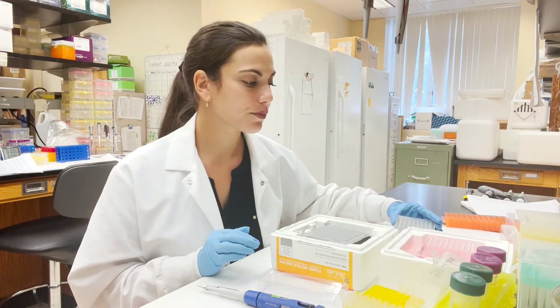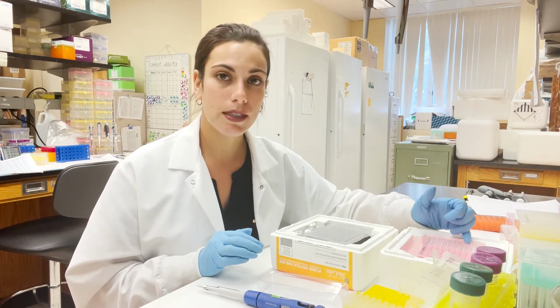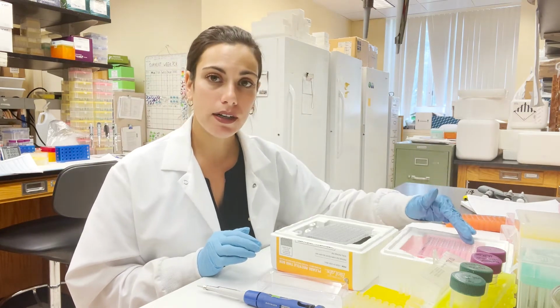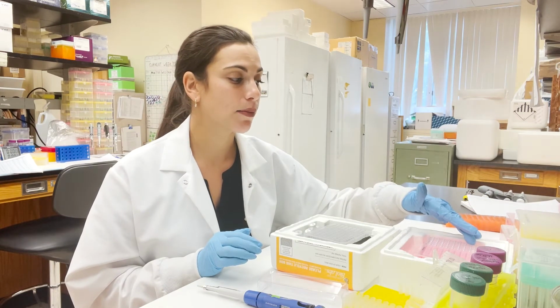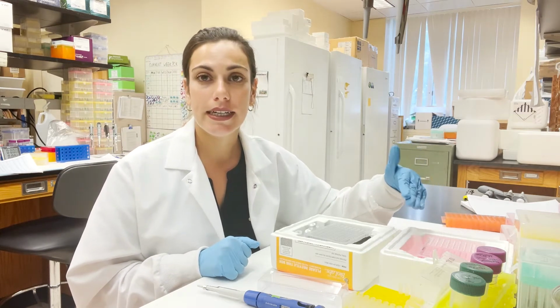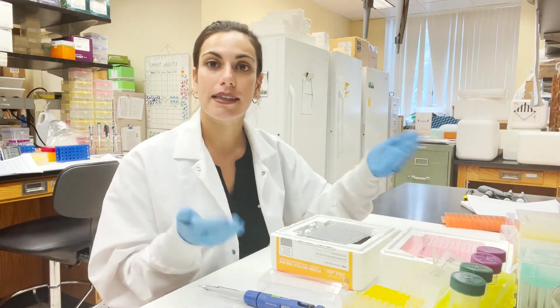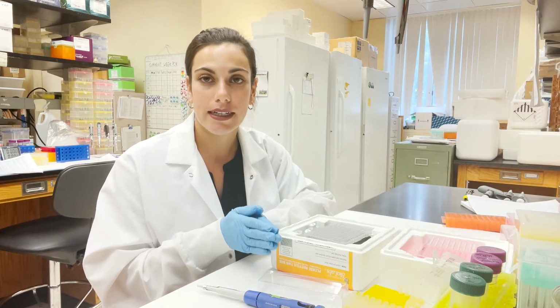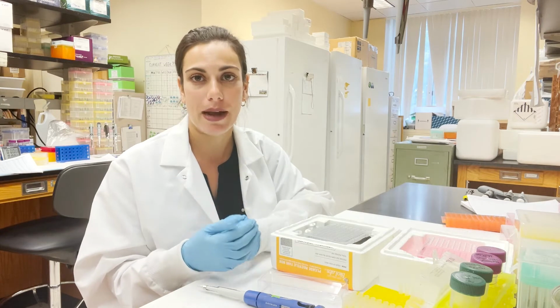digested fragments. This is a really important step because these adapters will each correspond with a different sample. So I could then use these barcodes later on in the sequencing processing to be able to determine that on plate 1 in cell A1, all of those DNA fragments belong to sample OCB02. So this is really important because at the end, we're going to be pooling all of our samples into one tube, and we need a way to be able to identify which samples those pieces of DNA belong to when we get our raw information back from the sequencing company.